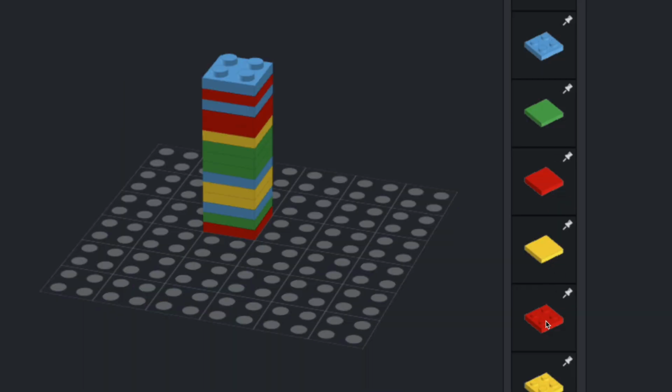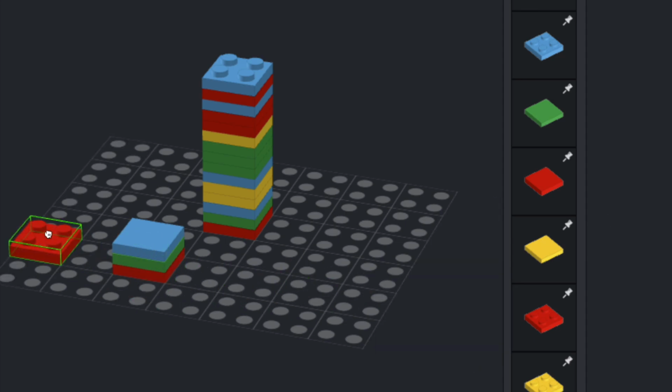So because Taq polymerase basically has this mixture of dNTPs and ddNTPs to be assembling the new DNA strand from, it's randomly pulling these pieces out, essentially the same as what you're seeing here with the Lego pieces, just pulling them out at random and getting either a dNTP or a ddNTP.